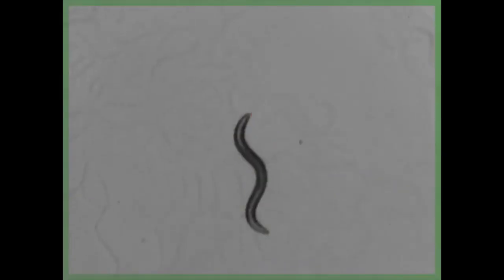So here is a very fast moving worm and this is where the computer software is very useful to keep up with the worm. As you can see the computer software tracks where the worm is going and the camera shifts accordingly.